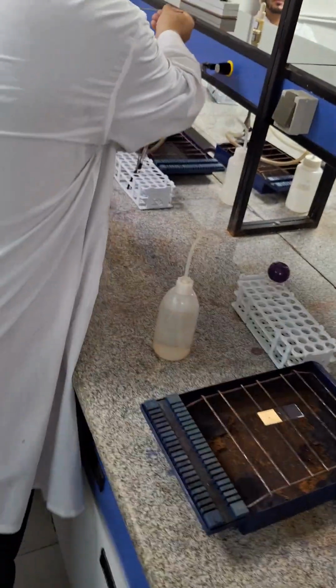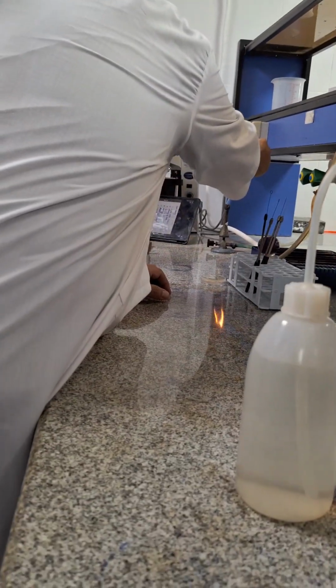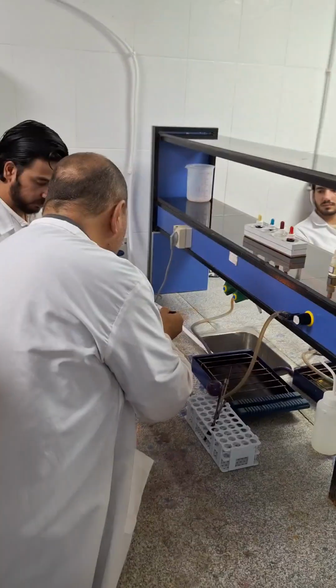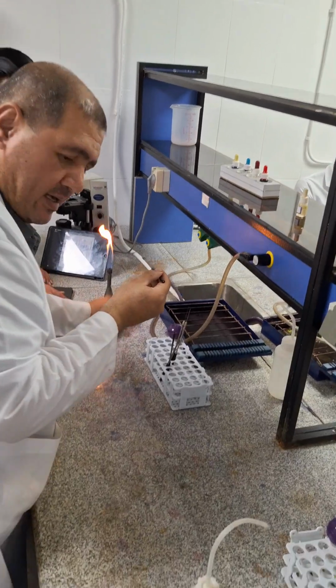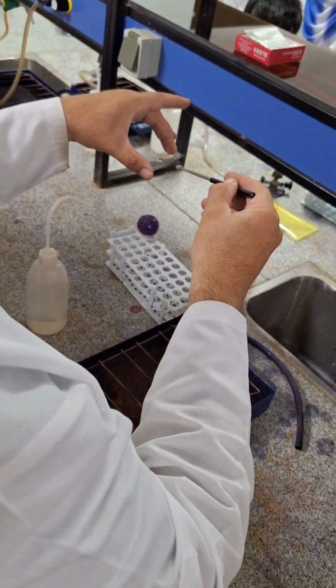Then sterilize your loop and take a very small amount of bacteria and mix it with water.